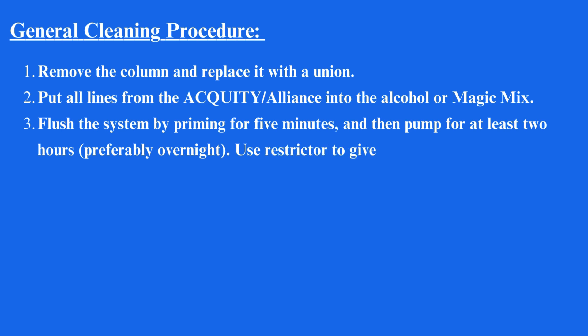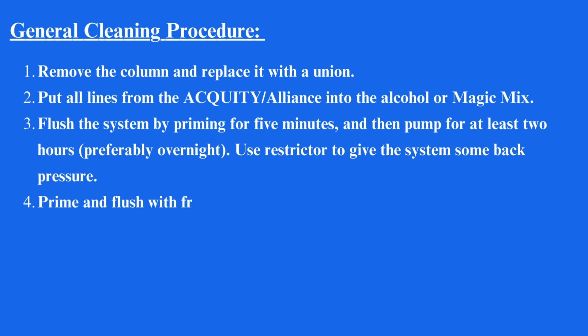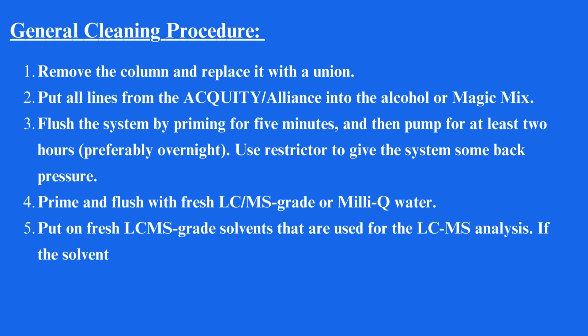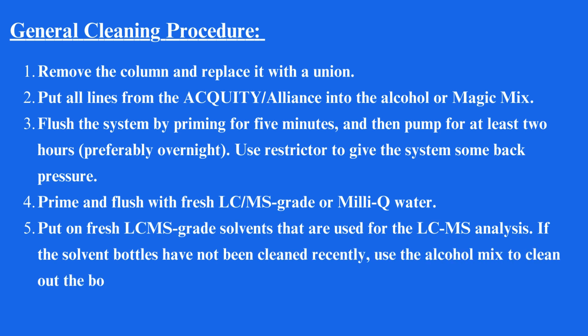Use a restrictor to give the system some back pressure. Prime and flush with fresh LC/MS grade or MilliQ water, then put on fresh LC-MS grade solvents used for the LC-MS analysis. If the solvent bottles have not been cleaned recently, use the alcohol mix to clean out the bottles, and then rinse them well with fresh solvent.